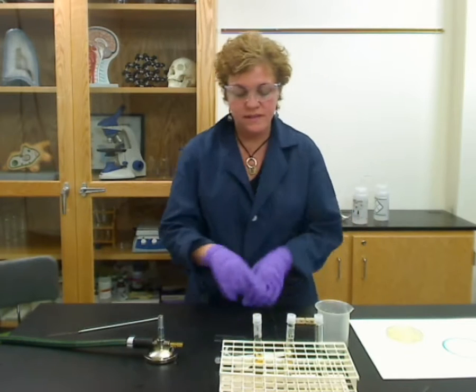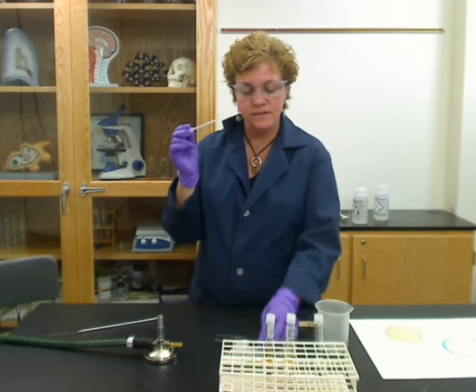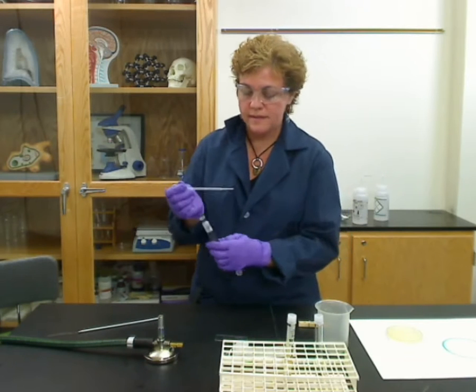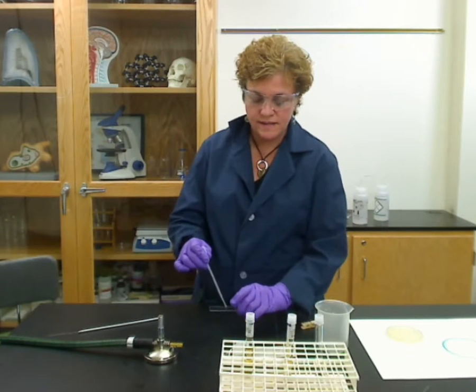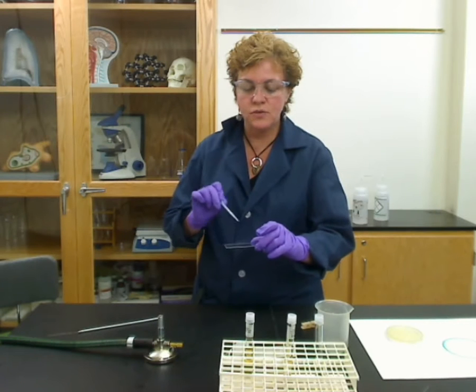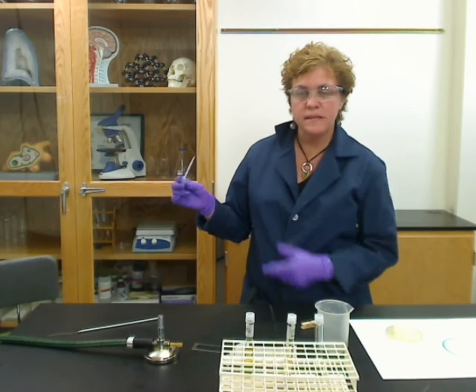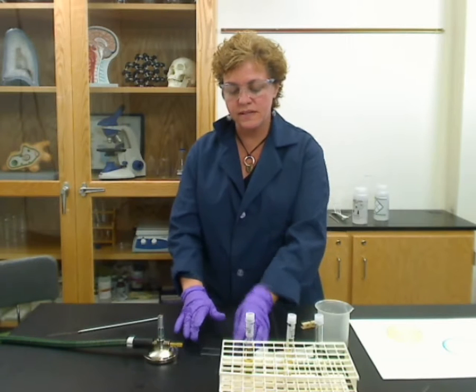If you're going to do a bacterial smear from a broth, that's even simpler. All you do is take a sterile pipette, open your tube aseptically, flame it for a couple of seconds, go in and get about a half a drop, flame again, and drip that onto your slide. Take the pipette end and spread it out as best you can — don't go all the way to the ends of the slide, just keep it about an inch and a half to two inches in the middle. Then set it down and wait a couple of minutes until it dries completely, just like for the agar slant.